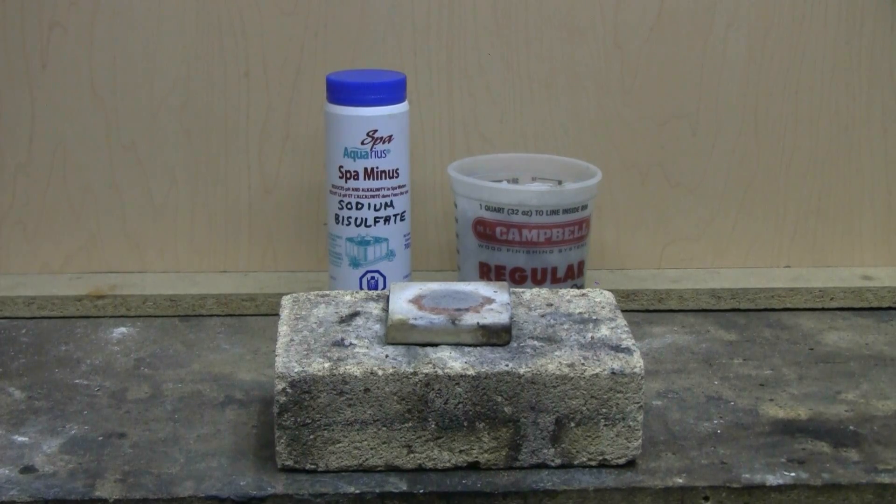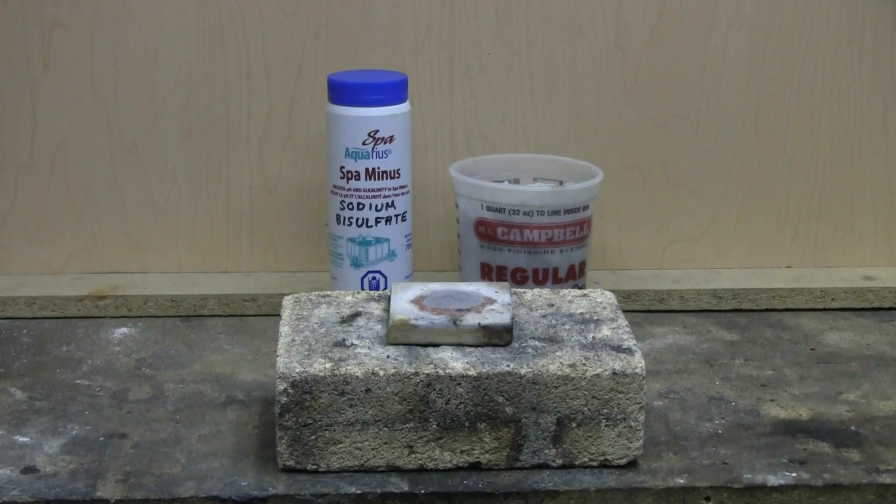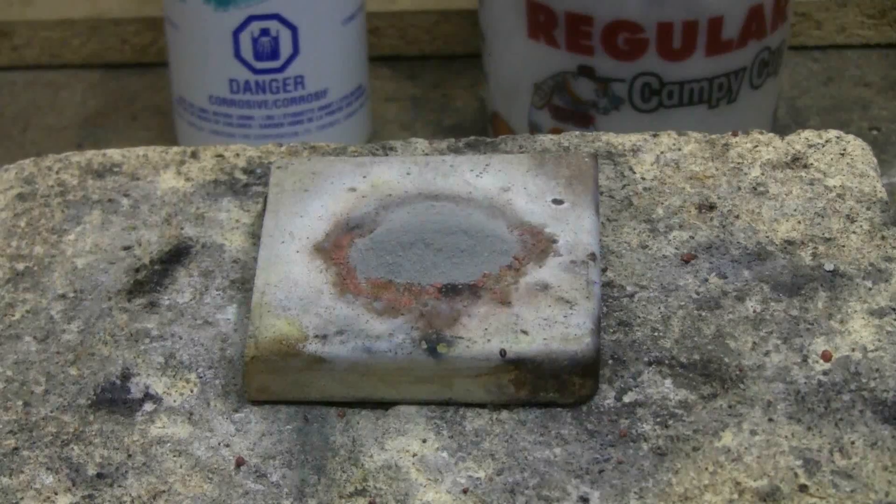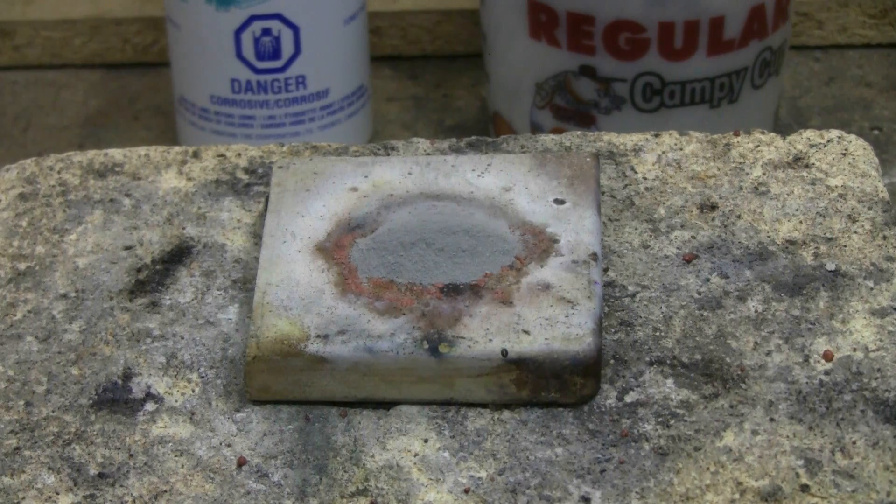In this quick chemistry video, we're going to take a look at the reaction between sodium bisulfate and powdered aluminum. On the small ceramic plate that's sitting on the fire brick, I have about 2 grams of sodium bisulfate and aluminum powder mixture.